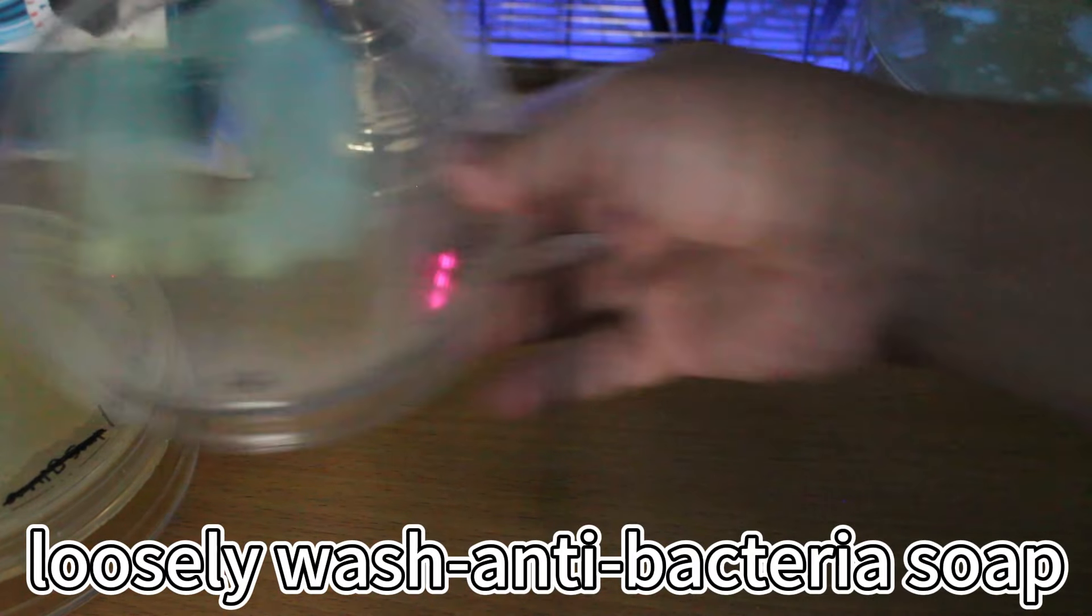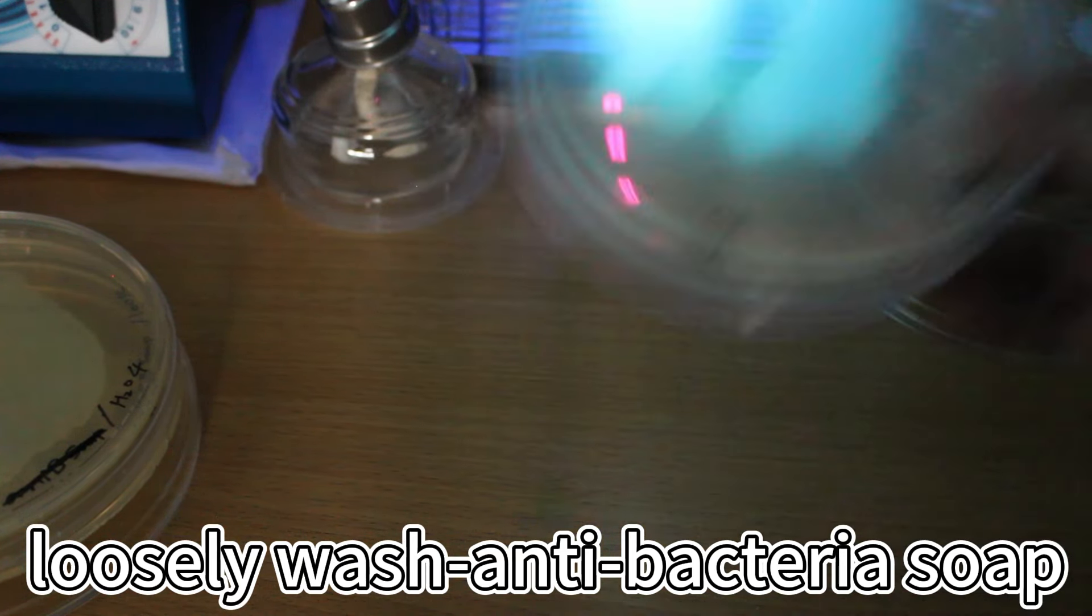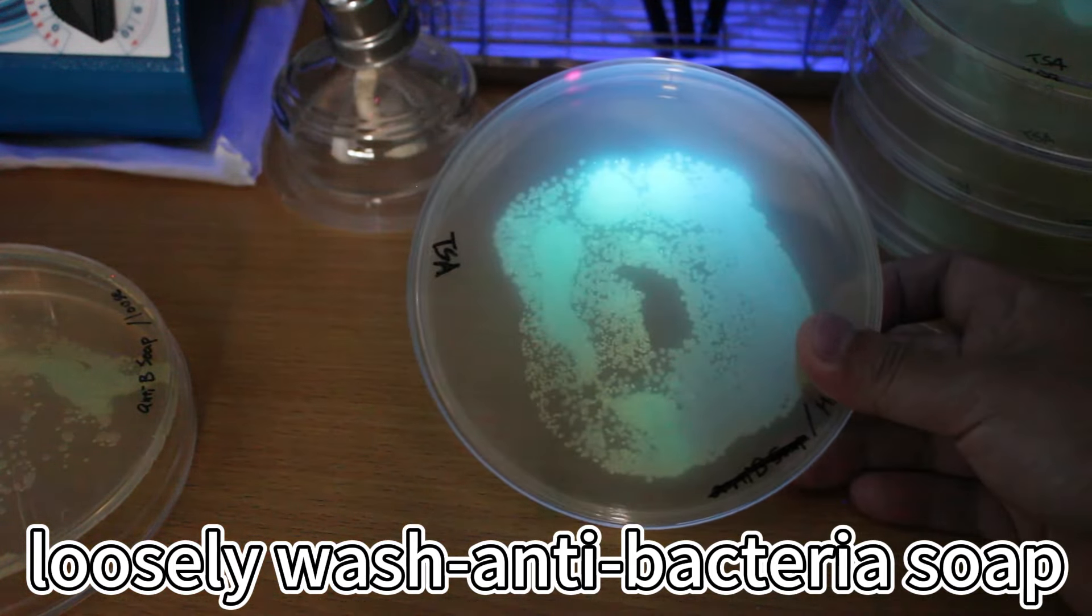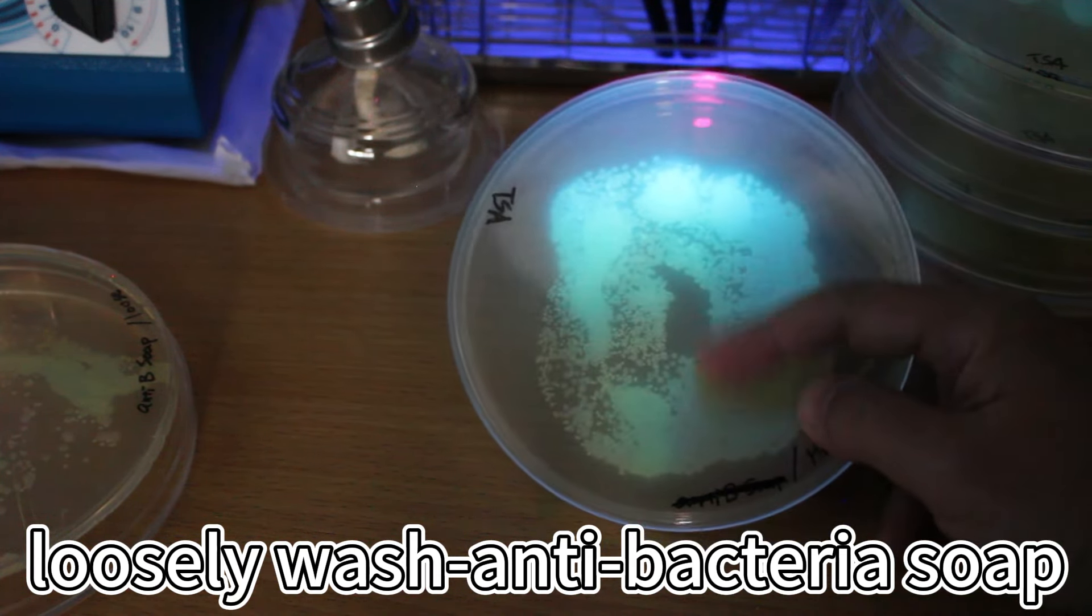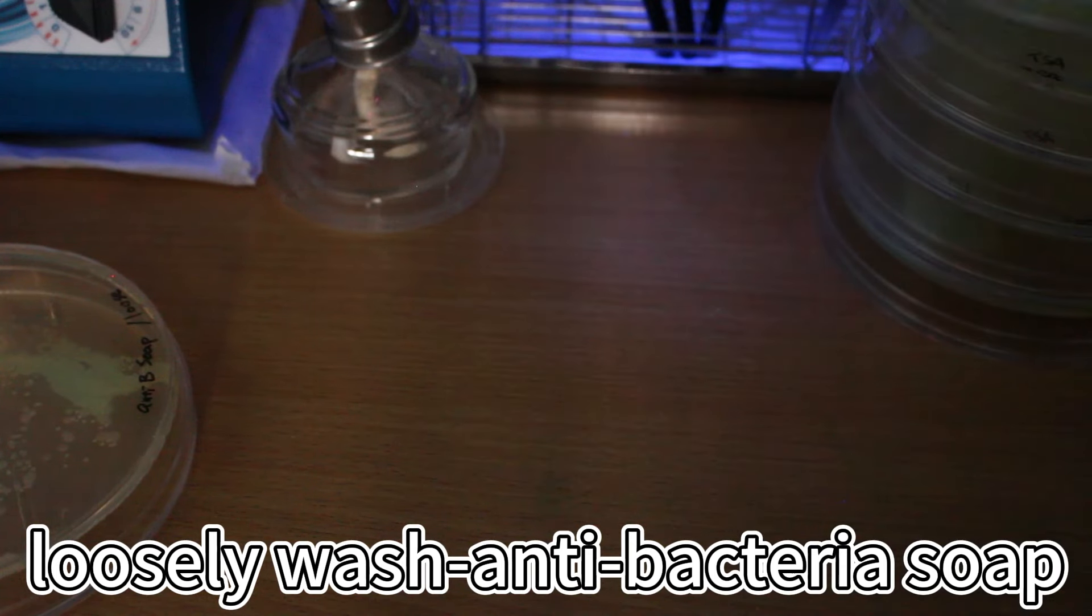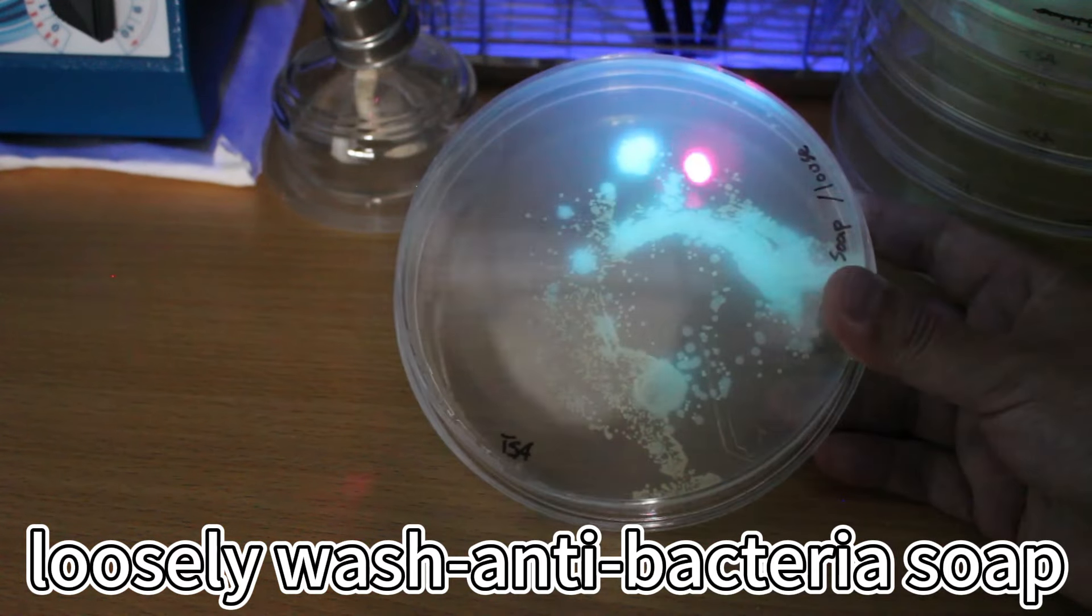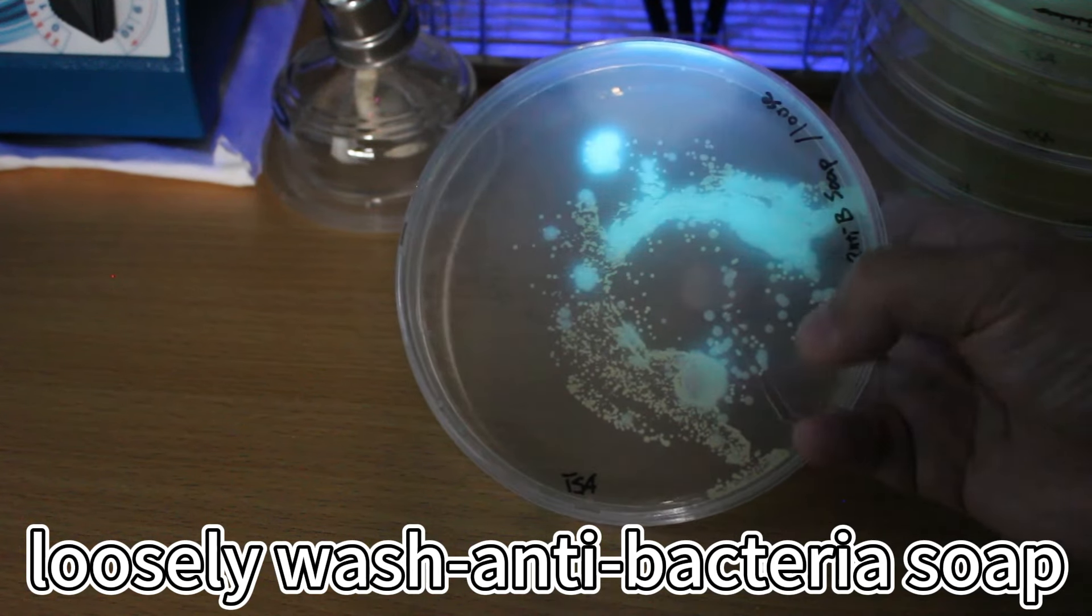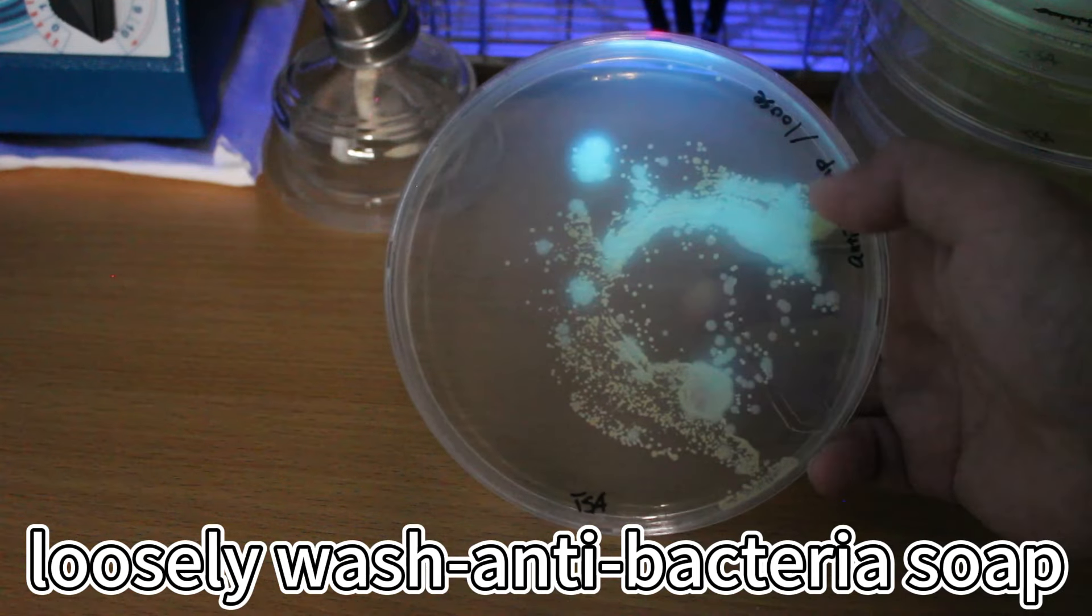Now to the antibacterial soap. So this is before wash. Again, after rinsing with water, and you can see that just rinsing with water, that does not help, almost helps nothing. And this is after wash with antibacterial soap. And you can see there are still fairly amount of the fluorescent colony there.